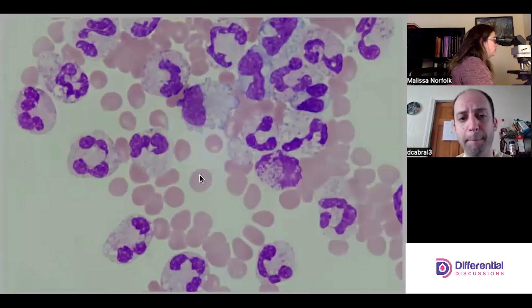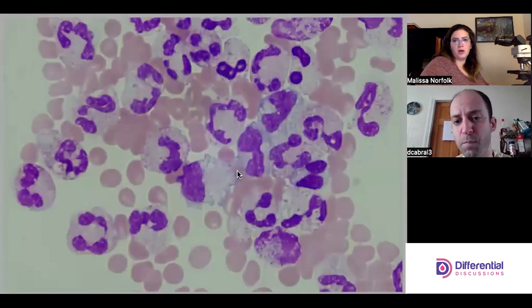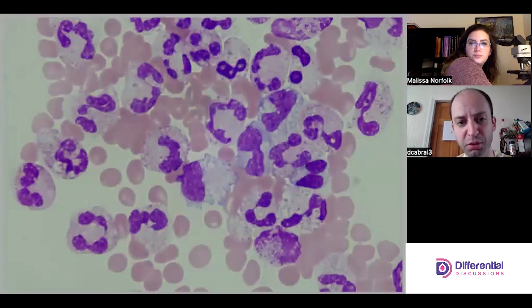Let me stop here just to showcase these monocyte cells. We can see that beautiful light blue cytoplasm — the coloration on this slide is perfect.